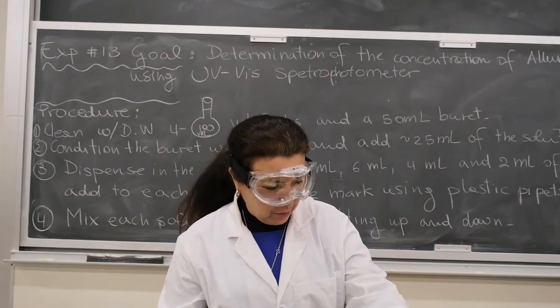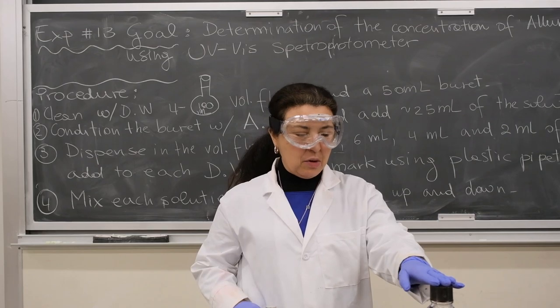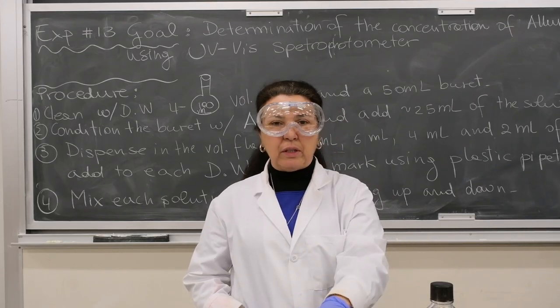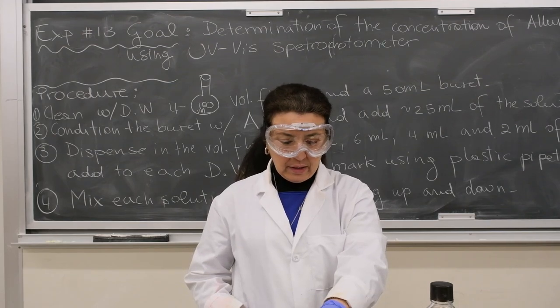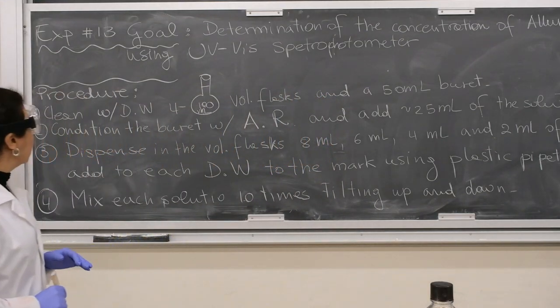And what we are going to do is we are creating a calibration curve with a known concentration of Allura Red. And then we are going to determine the concentration by interpolation of two unknowns that I'm going to assign you. So let's see the procedure.